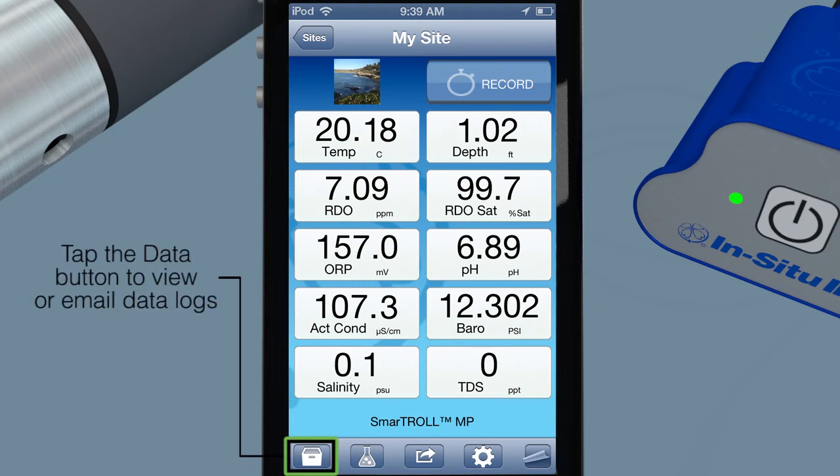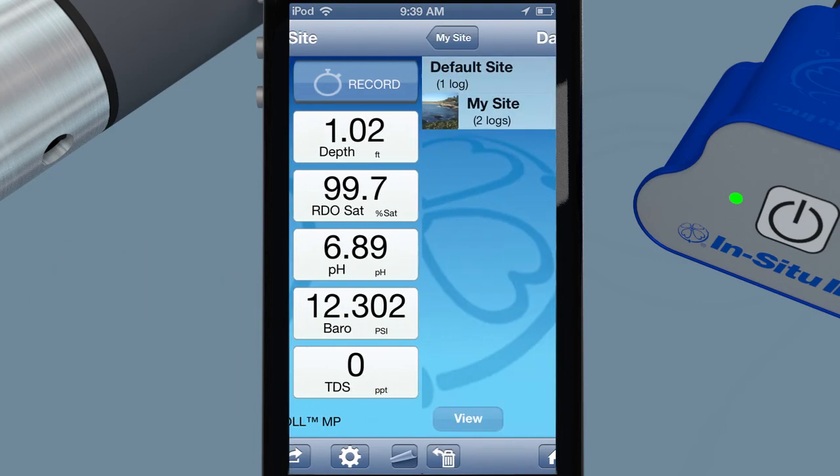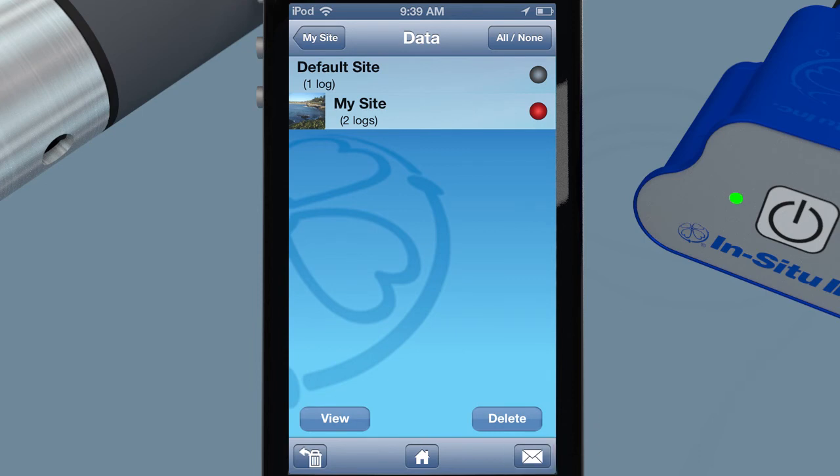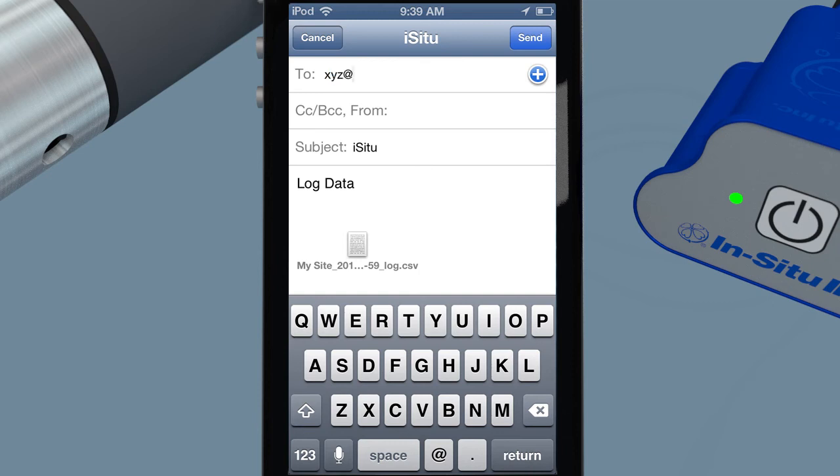View previous data logs to compare your results. Instantly collaborate with colleagues and clients by using your smartphone to email data. Send them a snapshot of real-time results or email an entire data log for seamless workflow between the office and your sites.